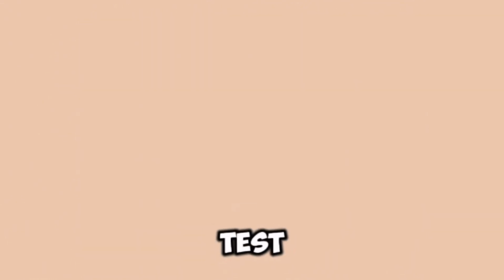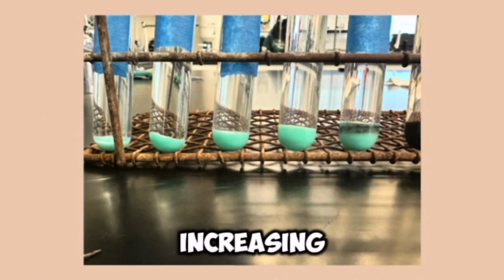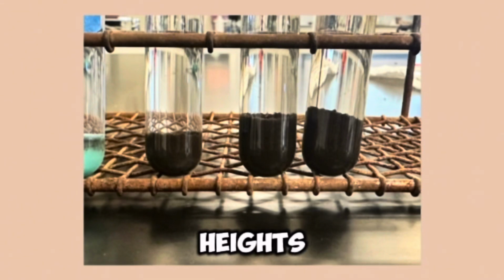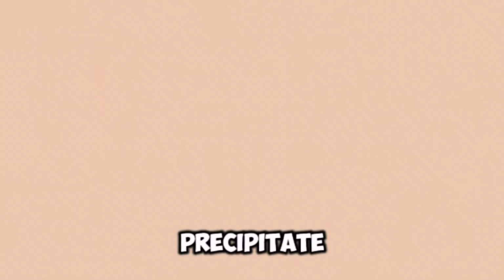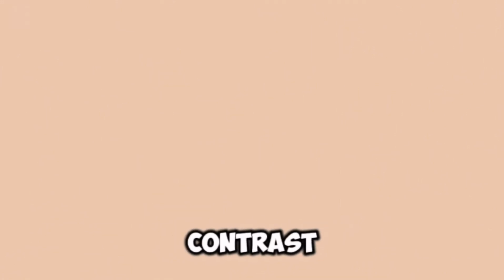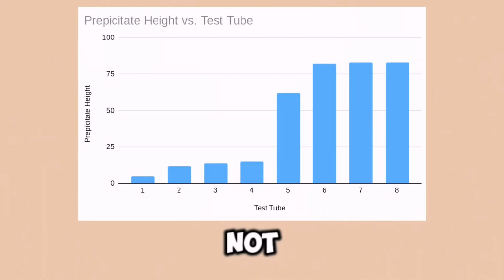In the first 4 test tubes, the limiting reactant was KOH because as you added more increasing amounts, you were able to produce an increasing amount of precipitate. The KOH limited or controlled the amount of precipitate produced. However, it was shown in test tubes 5 through 8 the heights of the precipitates leveled off while CuSO4 stayed about the same. This means that CuSO4 controls the amount of precipitate produced. In contrast, the KOH kept increasing and the amount of precipitate was not affected.